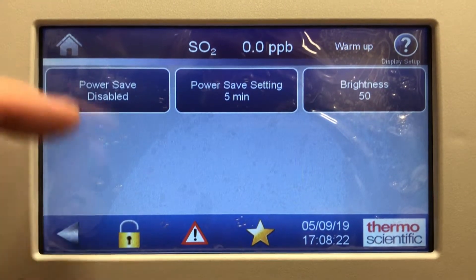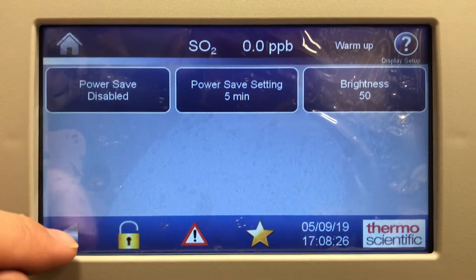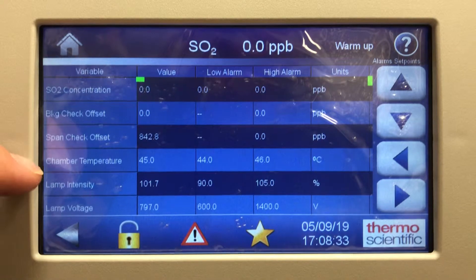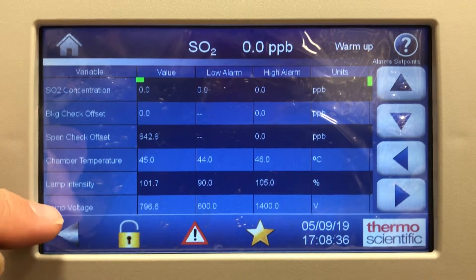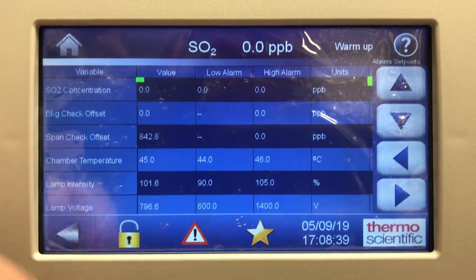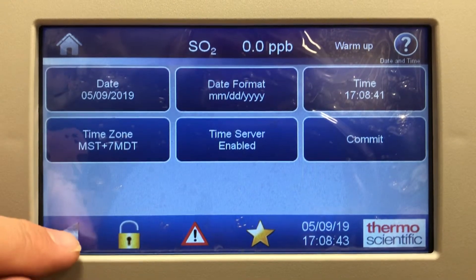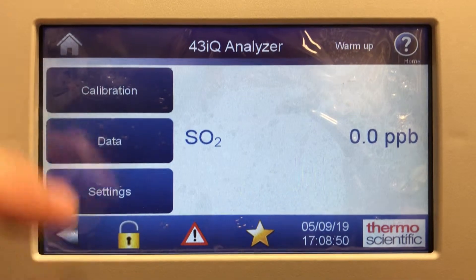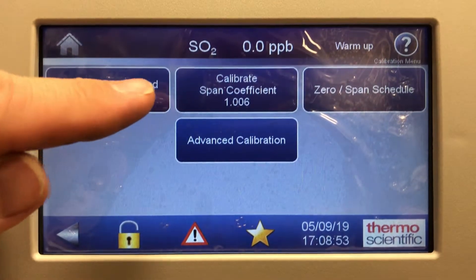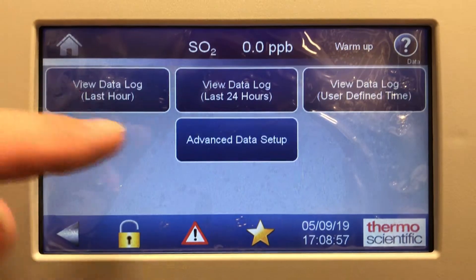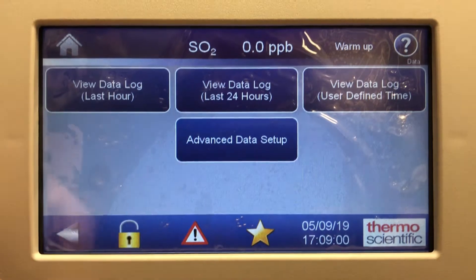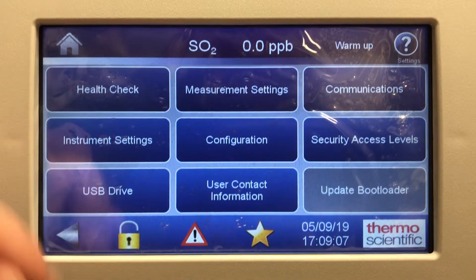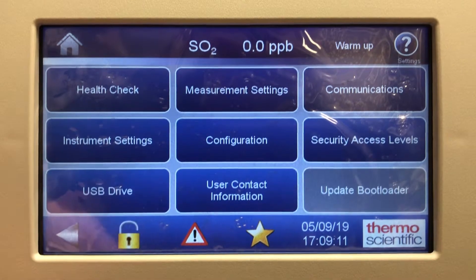There's a display setup with power save mode — it shuts down the display so it lasts longer and doesn't burn out. There are quick alarm set points: low and high alarm set points for spans, backgrounds, lamp intensity, lamp voltage set points, and max/min values. There's also a clock and time format setting. So in summary, the settings screen includes calibration, background span coefficient, the data screen with last hour and 24 hours data, user-defined data, health check, measurement settings, communications, instrument settings, configurations, security access, USB, and user contact information.